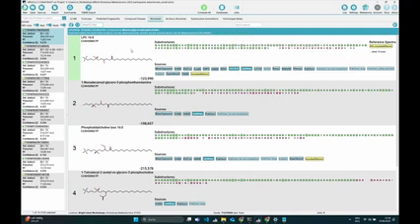Then it searches in the result list if some of these structures belong to that class and flags them by this blue lipid class tag here, so that you can see, okay, now I know it's this lipid class, and some of my candidates belong to this class. So that's what we can do right now to help you with annotating lipids.